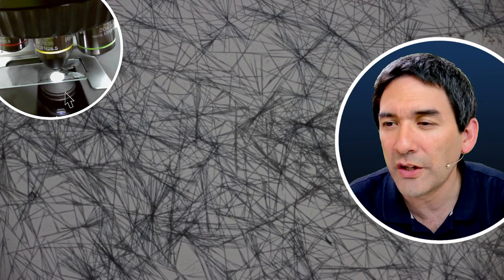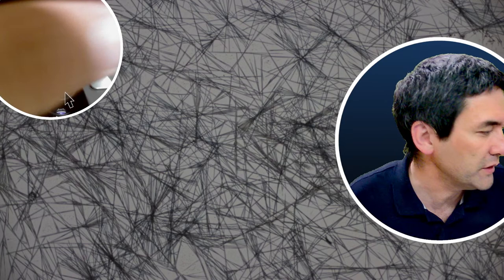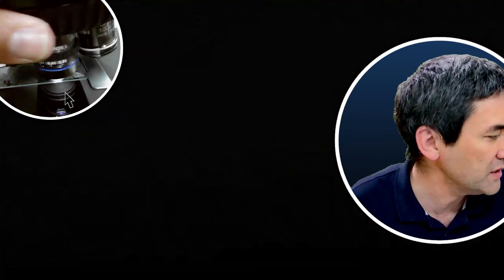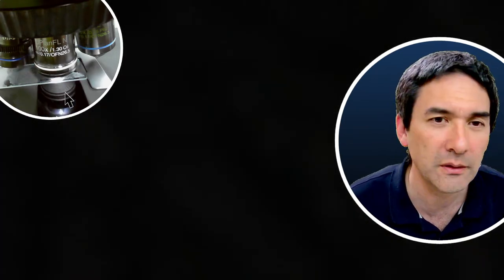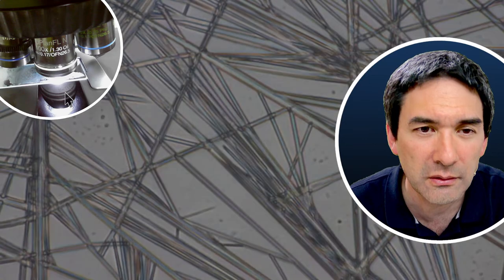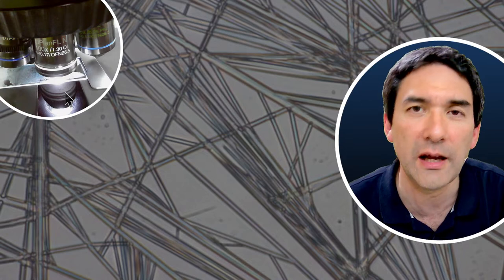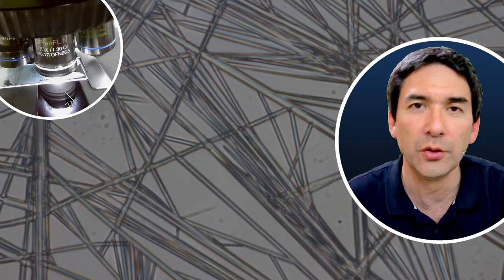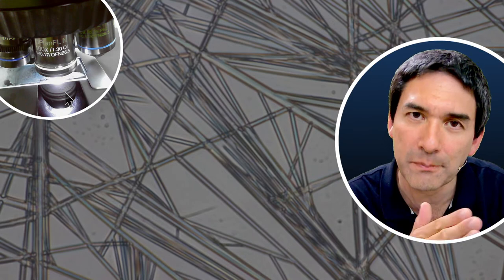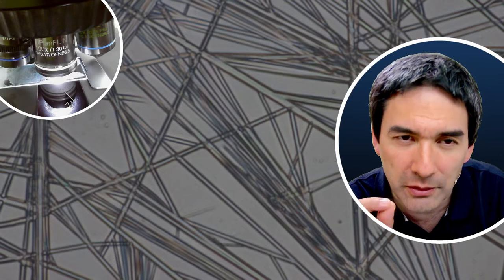Do I see some coloration under the 100 times bright field? Interesting. Are you saying this could be some kind of chromatic aberration? Let me see. There shouldn't be any coloration. If there are colors, then this could be, indeed, a little bit here. It does not necessarily have to be chromatic aberration, but sometimes those crystals also act like prisms and they split up the light as well. So this could also be a reason why there might be a little bit of color on the edges.